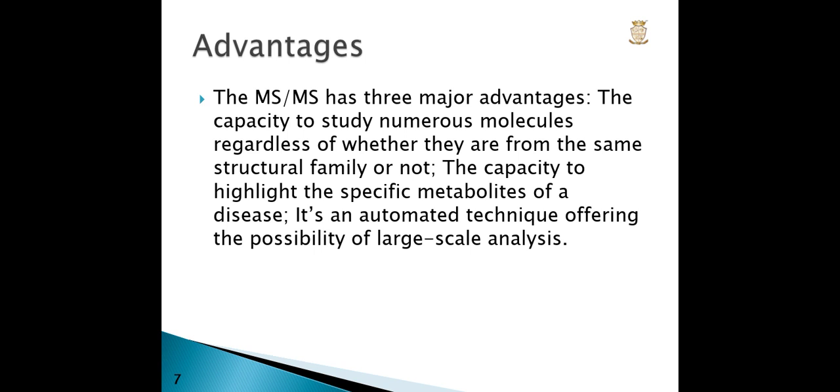Advantages. Mass spectrometry has three major advantages: the capacity to study numerous molecules regardless of whether they are from the same structural family or not, the capacity to highlight the specific metabolites of a disease, and it's an automated technique offering the possibility of large scale analysis.